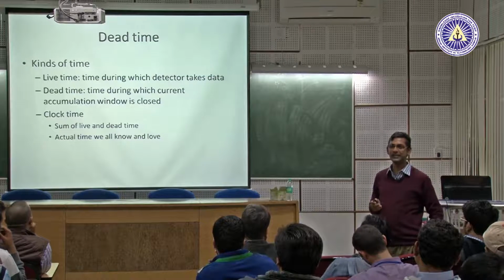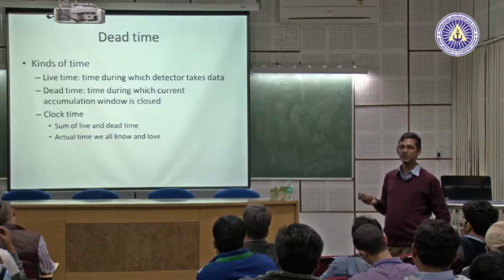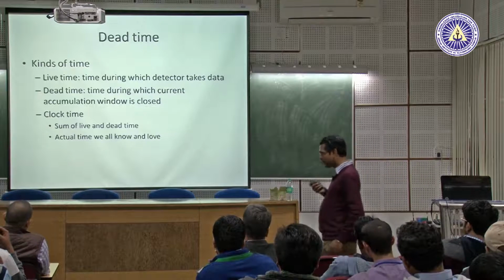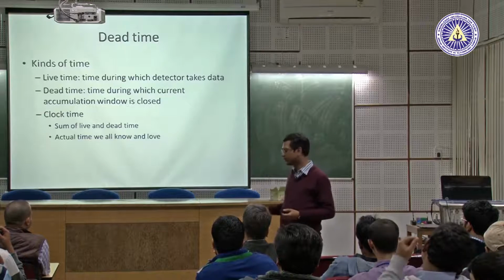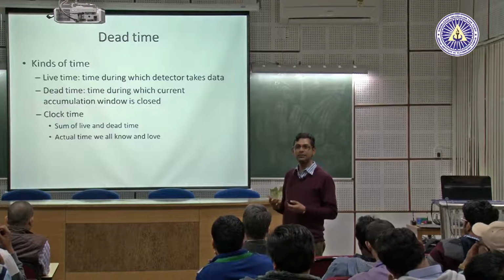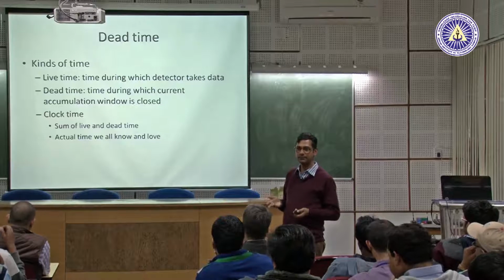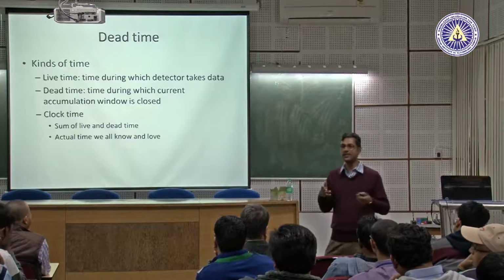Dead time really means dead time. The detector is dead, and this is very important. What is this? Well, these are electronics, right? You feed the X-rays onto these detectors, and it takes time to analyze the data, because of how the detectors work anyway.